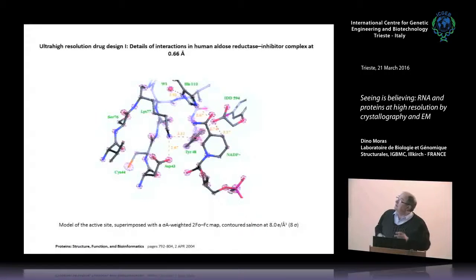And you see that all these spots here are experimental electron density. So at that level, you can see here the water molecule. You see all the heavy atoms, so-called heavy atoms. Oxygen is a heavy atom, carbon too, compared to hydrogen.